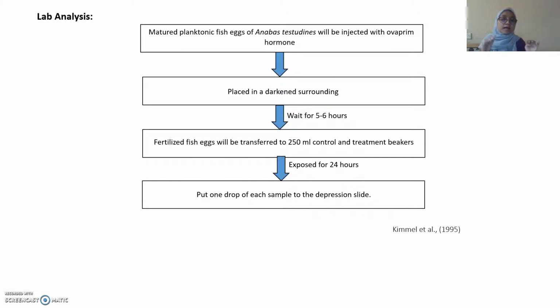We noticed that some eggs float and some eggs sink. The eggs that float are the fertilized eggs, and the eggs that are not fertilized sink to the bottom. All the unfertilized eggs were removed before we took out the fertilized eggs. Then we exposed and analyzed them for about 24 hours.